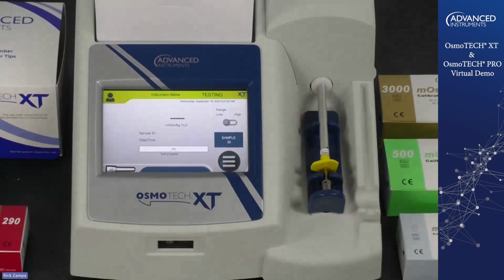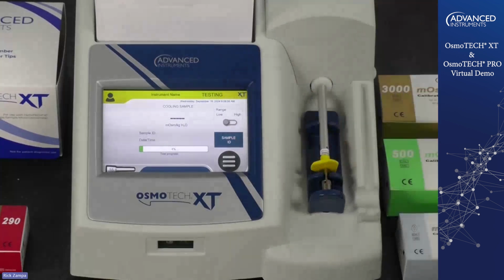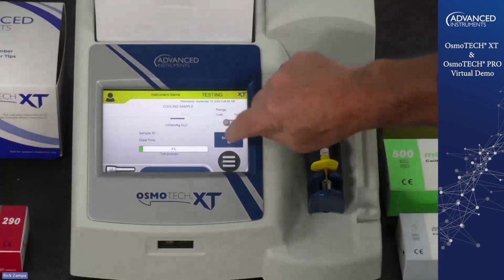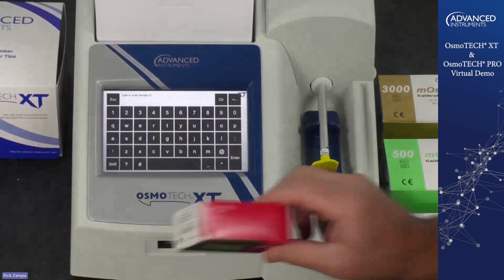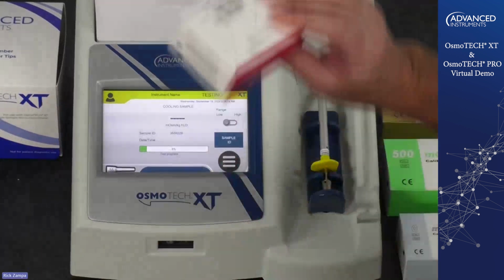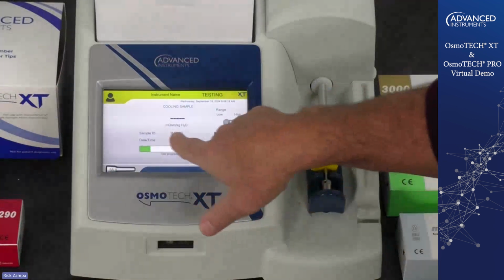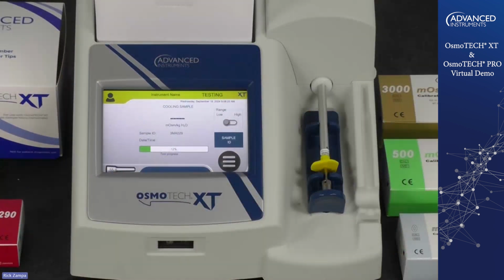The sample does not get aspirated into the instrument. The test is being run in that sample tip that I put on that sampler. So what I'm going to do now, just because I want to, is I'm going to show you, I'm going to put in a sample ID. Once I start the test, I can do that. I use the built-in barcode scanner to scan the box of the 290 reference solution, and it's added the sample number 3MA029, which is the part number for that solution.